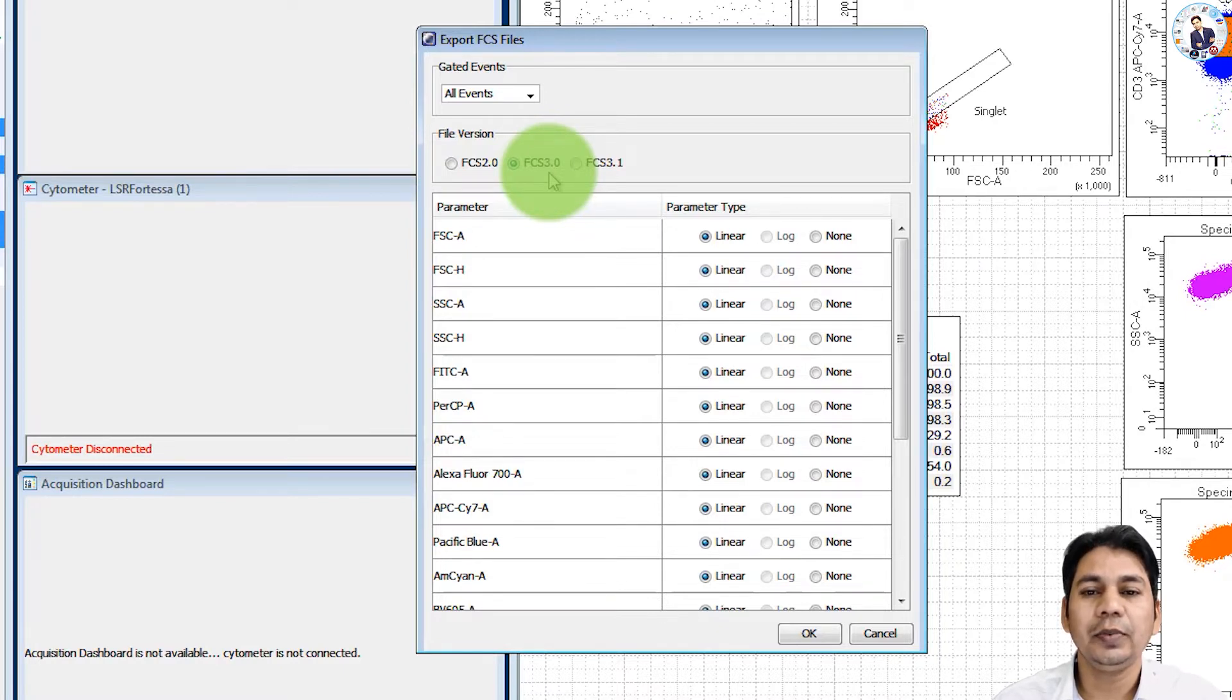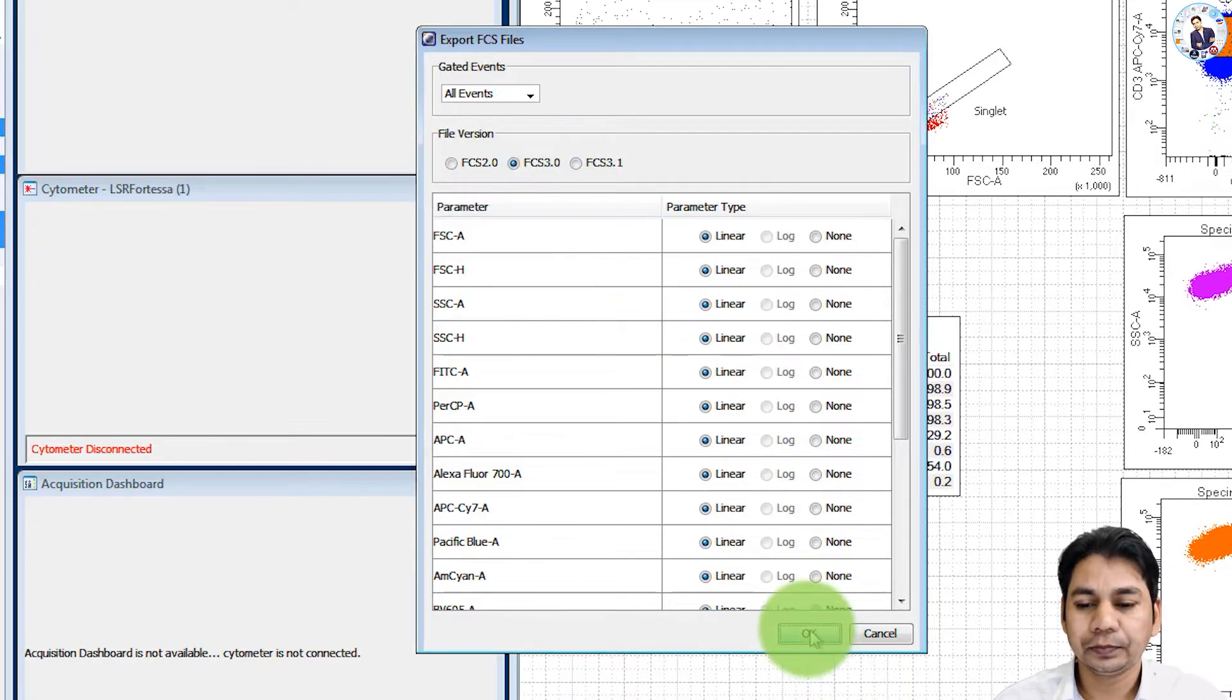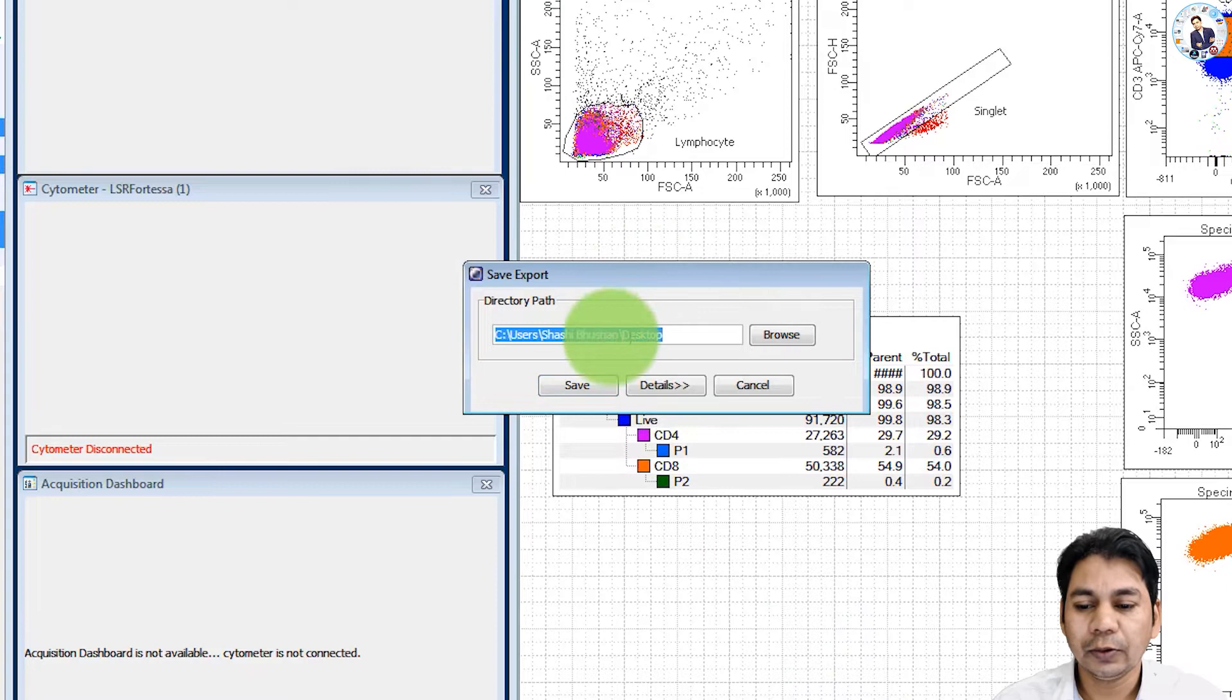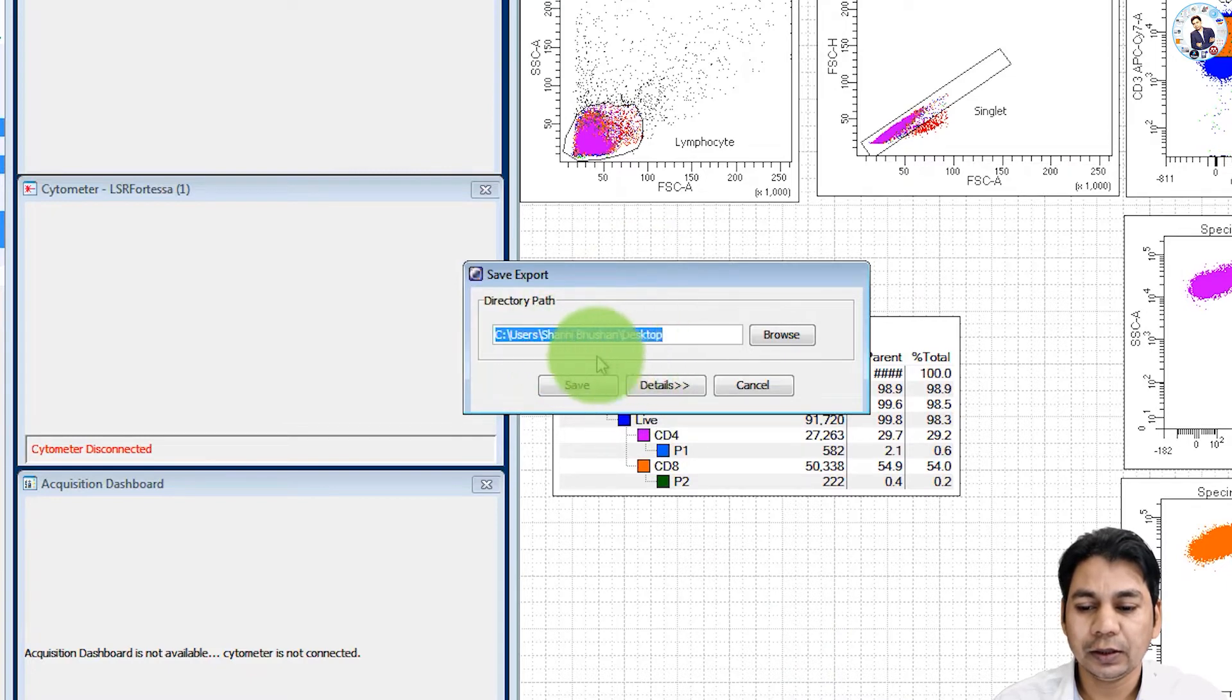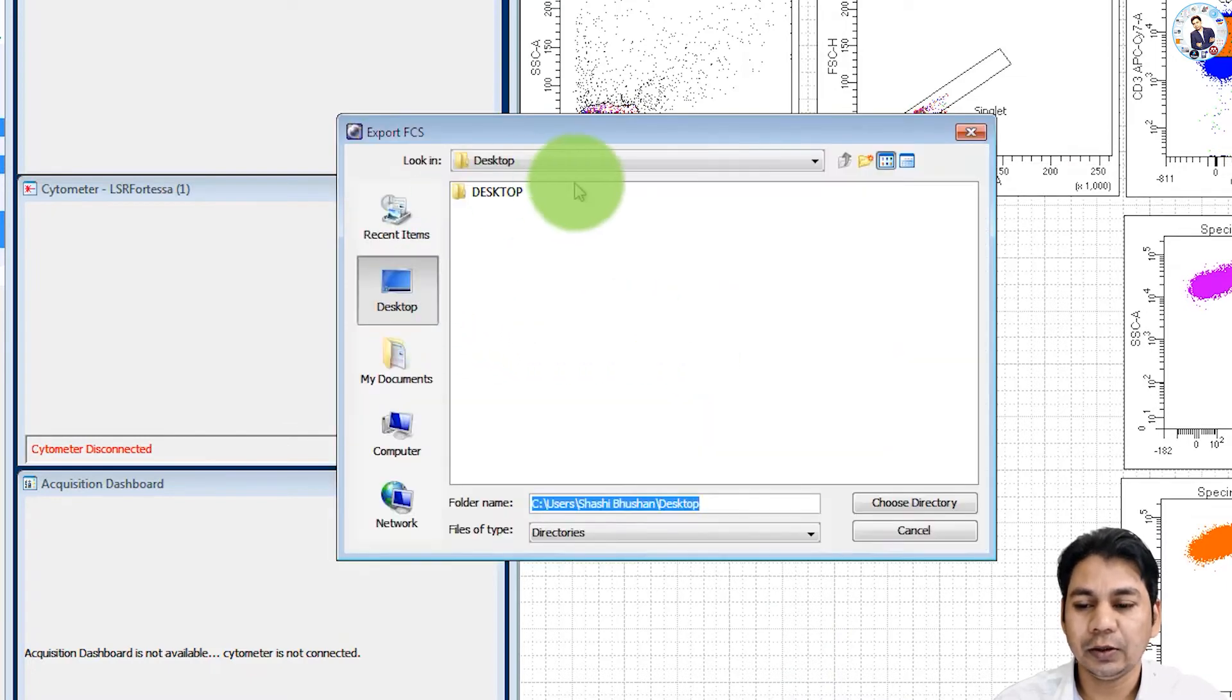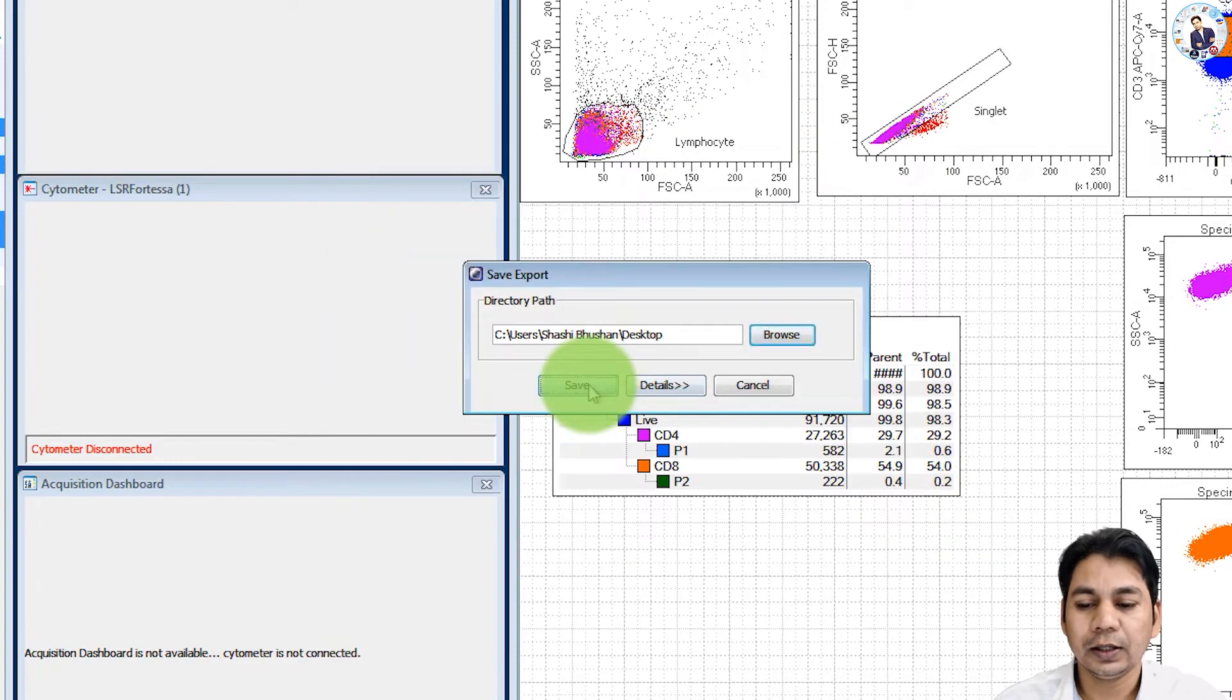Otherwise, you will not be able to analyze your data. Click here on OK. It asks for the location. I am selecting the desktop, but you can change if you want and click on save.